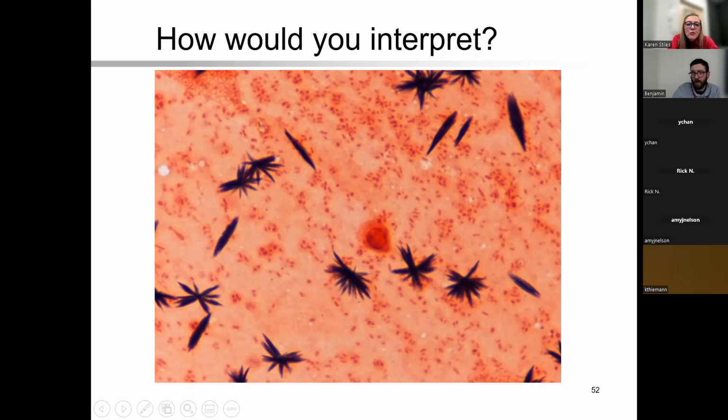And just to add, Ben, the gram-negative coccobacilli, that's the thing about Haemophilus influenzae. Sometimes it can do weird things, like you can on occasion see a little gram-negative rod in there, and yet it's still the Haemophilus too.